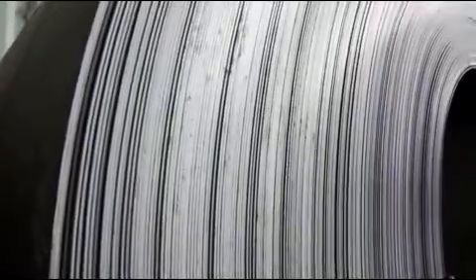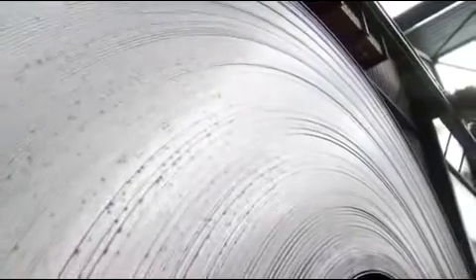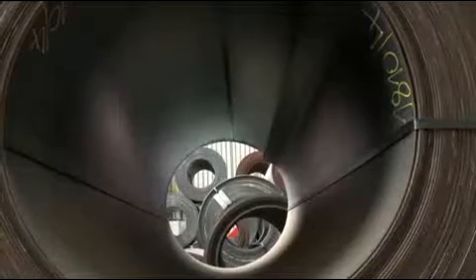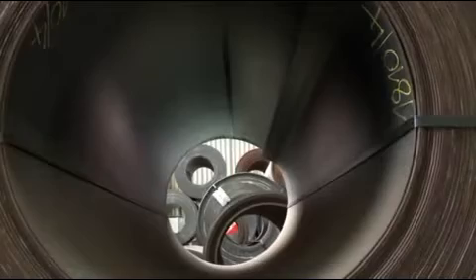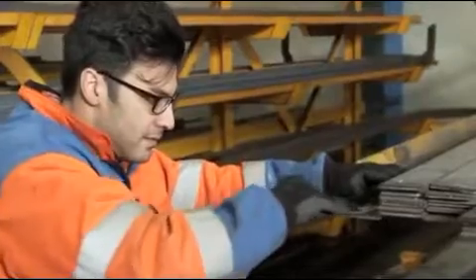As Equostat 3 uses the micro-indentation method for hardness testing, sample preparation prior to testing is vital for good results. The surface of the sample must be level, flat, smooth and clean. It is very important that the surface of the sample meets the required maximum roughness of 2 microns for the best accuracy.